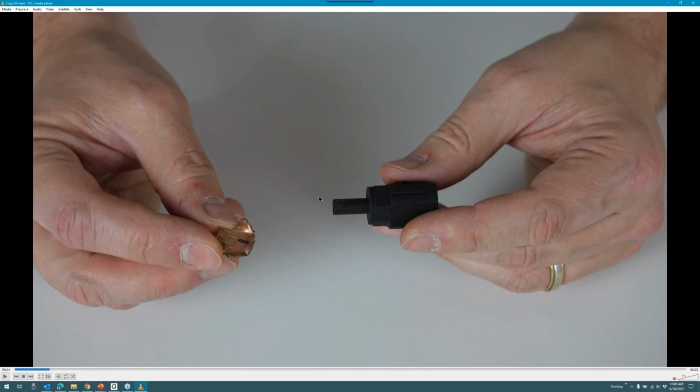The reason is that when this stub is mounted onto the rotation shaft of the Bullet Trax acquisition unit, by bisecting that region through the midpoint, that means that whatever rotation is going to take place during the acquisition is going to be a balanced amount of rotation. It's going to be a predictable amount of rotation as well. And anytime I can take a step to make the transition across a deformed surface act more predictably, I'm going to use that to my advantage. So an imaginary line should be cut through the midpoint of the region.